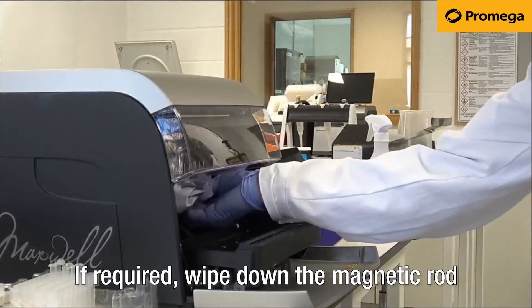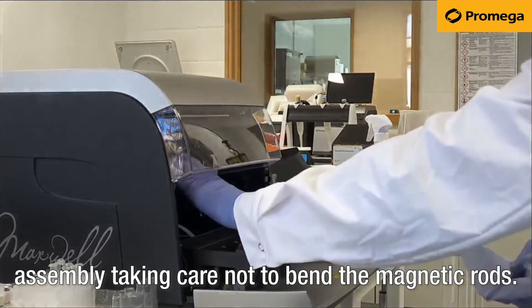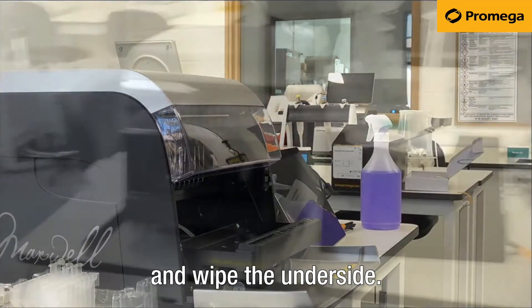If required, wipe down the magnetic rod assembly, taking care not to bend the magnetic rods. Press the plunger bar downwards and wipe the underside.